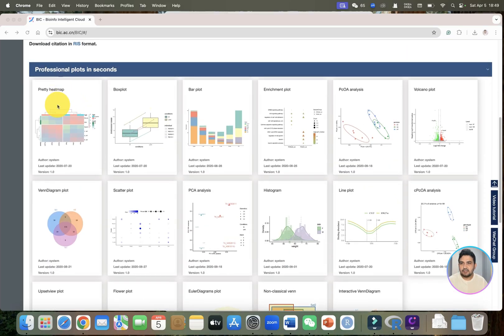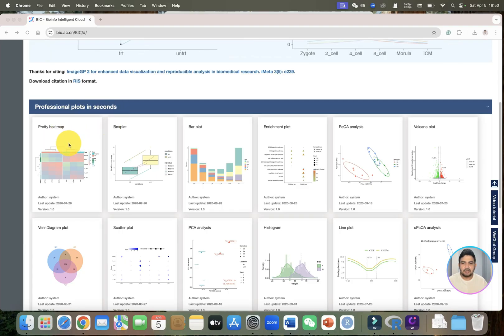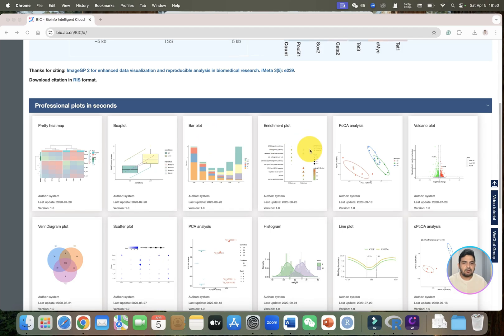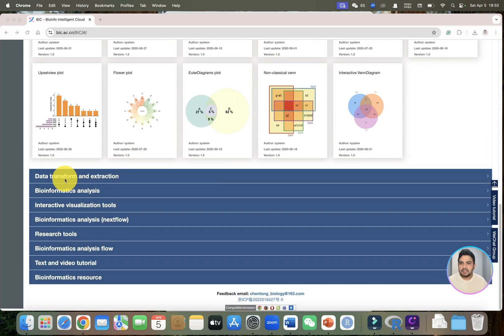As you can see, we have professional plots which we can draw in seconds. We can just paste our data and with just a single click we can get all these pretty heatmaps, box plots, bar plots, enrichment plots, and even more.